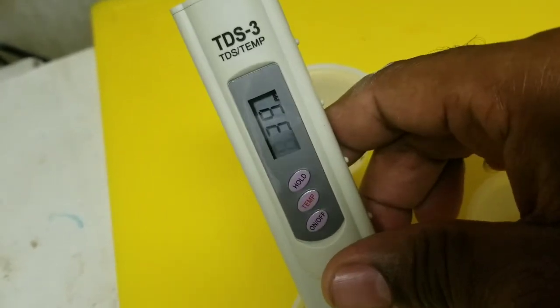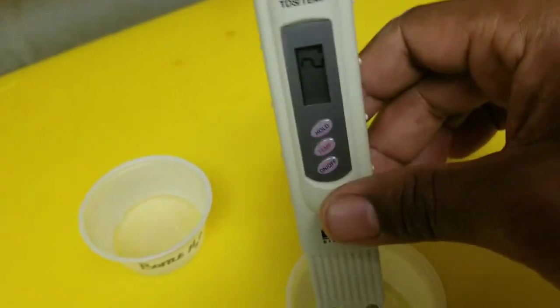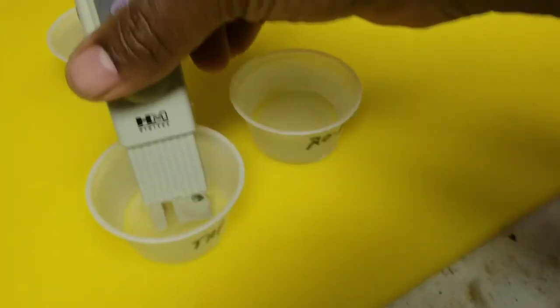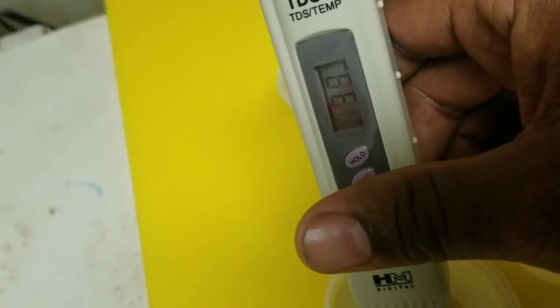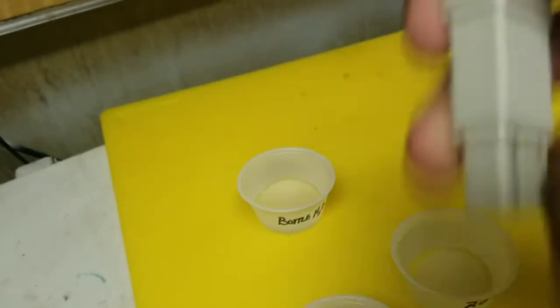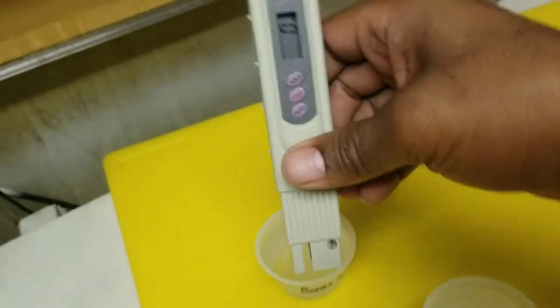That is a level of 39 total dissolved solids, and that's in the tap water. So a big jump, 40-point jump from the RO unit water, which is still coming up 0. I'm shaking it off, to the tap water, which came up 38, 39, 39. You can read that. Now let's shake it off really good. There is a level of imperfection as with any test, but let's go for the bottled water.